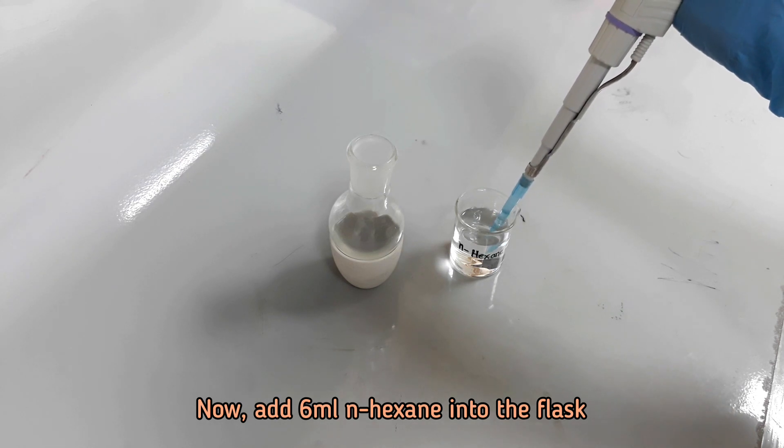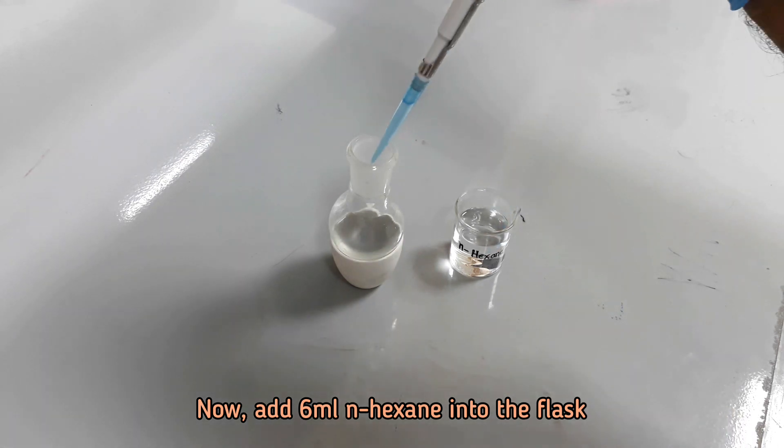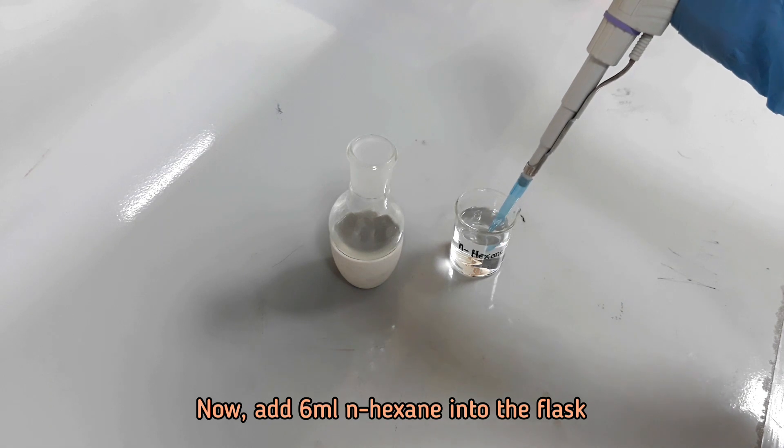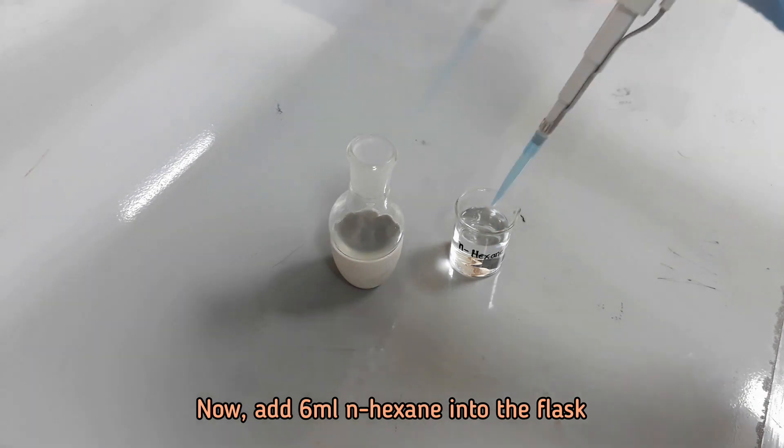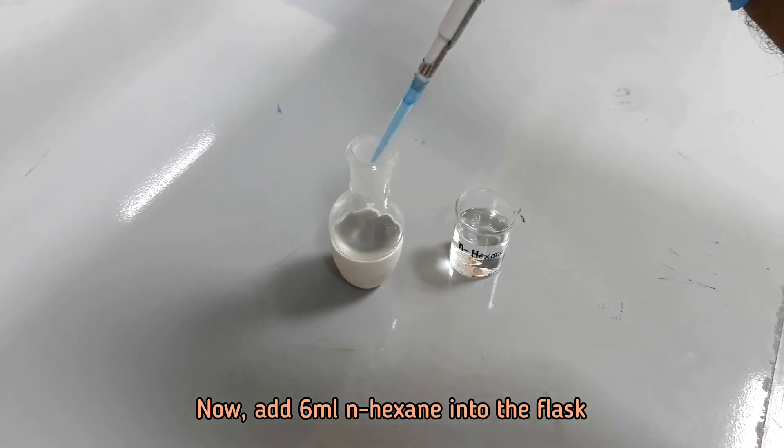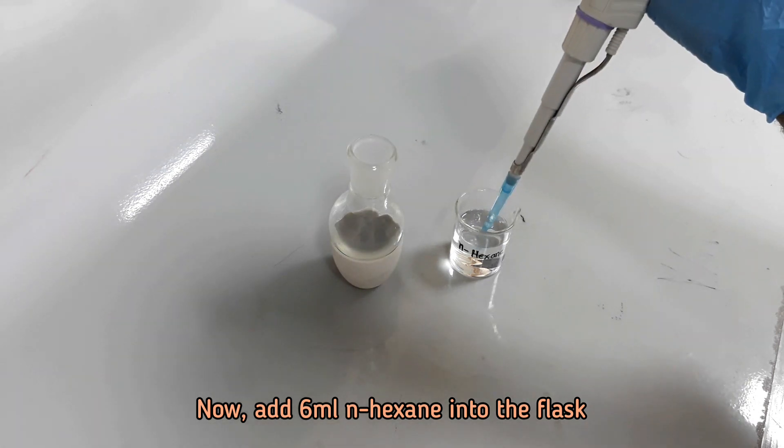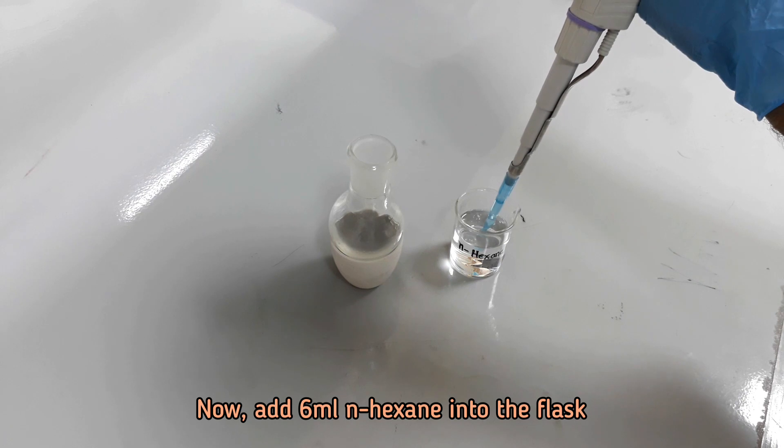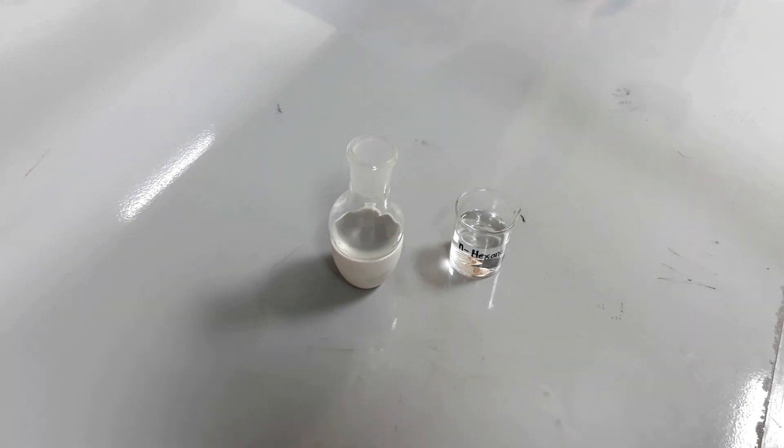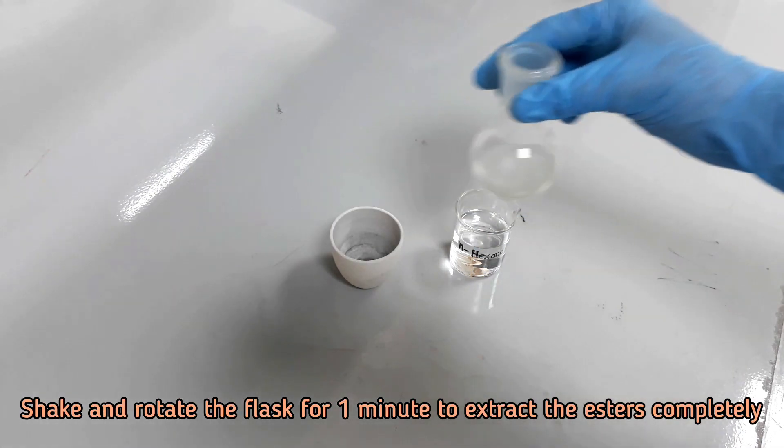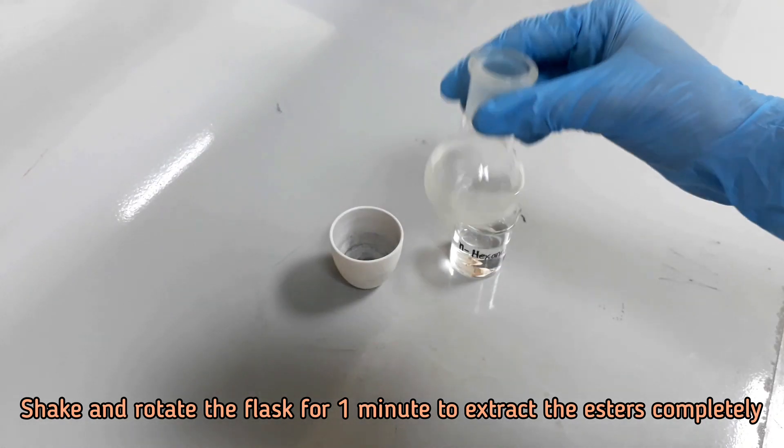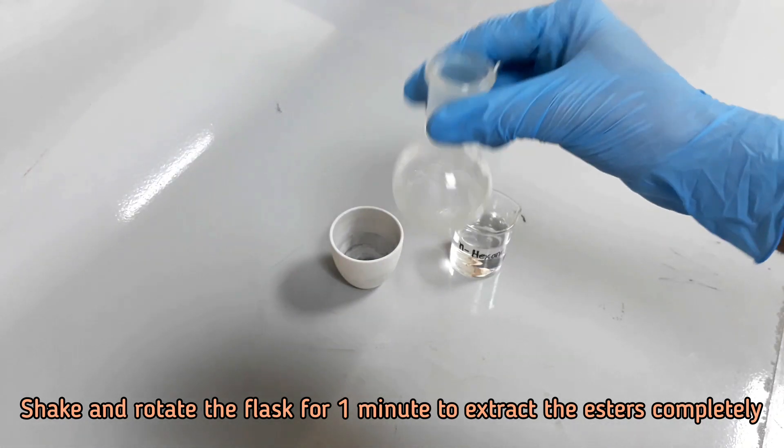Add 6 ml N-hexane into the flask. Shake and rotate the flask, ensuring complete extraction of the fatty acid methyl ester content.